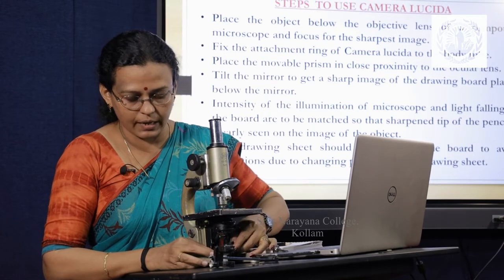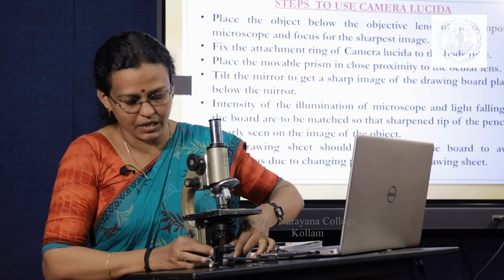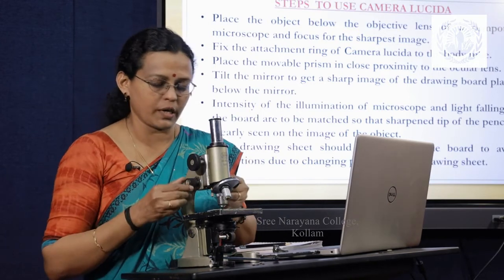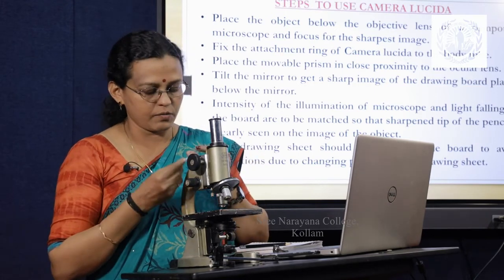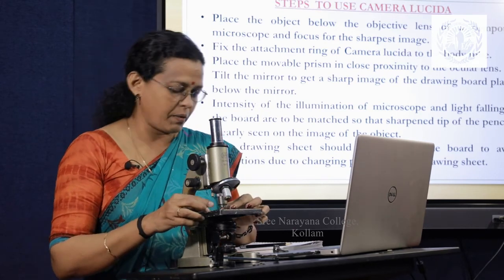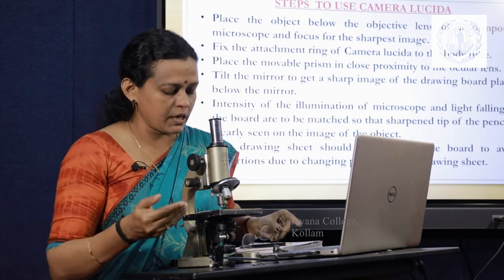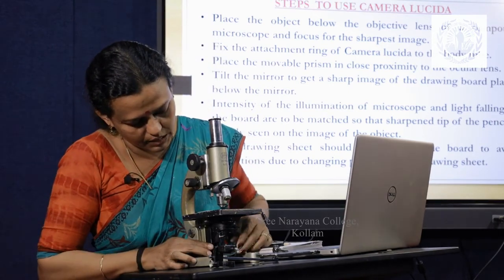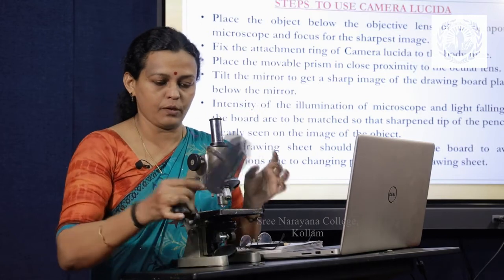Then this mirror can be rotated 360 degrees so that the light can be adjusted from any direction. Then you do the coarse adjustment, you can do the fine adjustment. So anyhow, you can adjust whichever object you want to see. Here I have taken a permanent slide which I will be viewing. I have placed it onto the stage, clamped it, and you can do this adjustment as usual with coarse adjustment and fine adjustment. You can take the light from any direction. Then I will show you how to mount Camera Lucida.